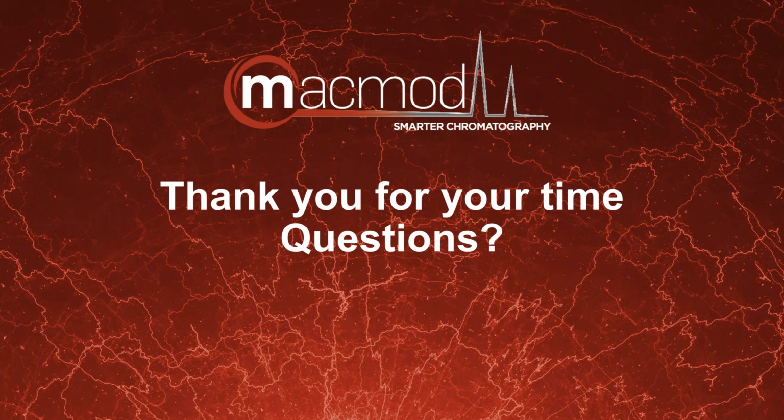Jeff, good job. Thanks, Perry. How are you doing? Good. Question for you. Sure. I know you showed a few chromatograms. It looks like you are using an isocratic mode. I'm just curious, if you use a gradient, can it improve your resolution, or have you tried it before?